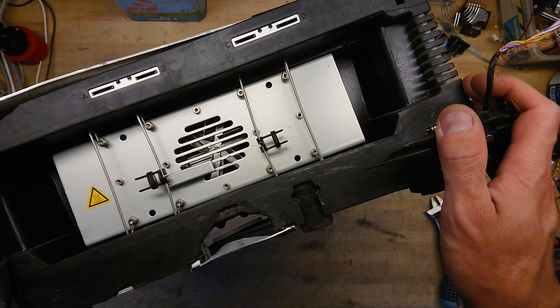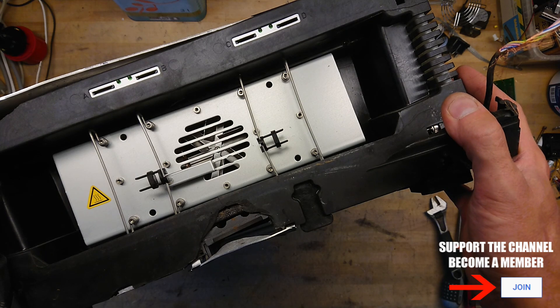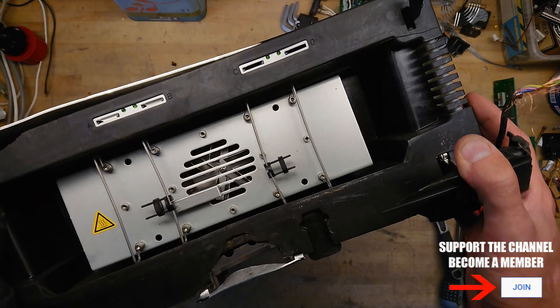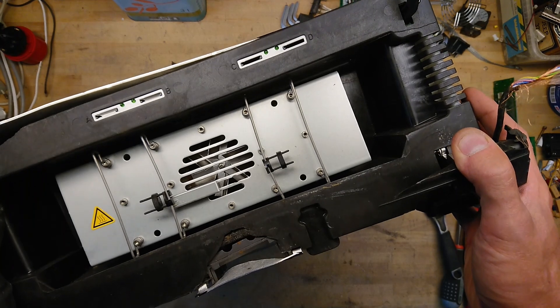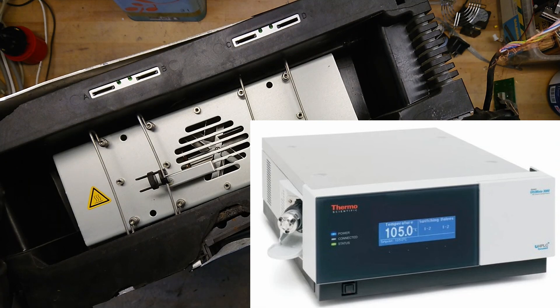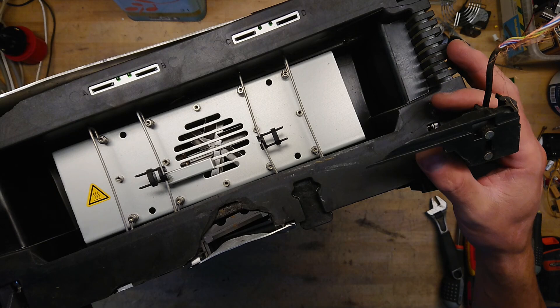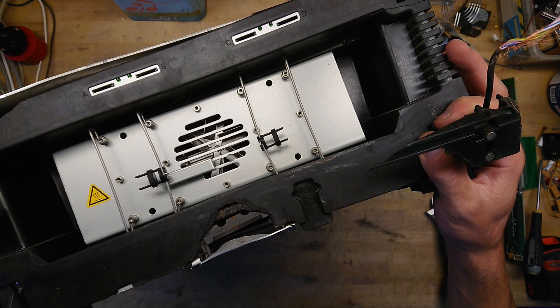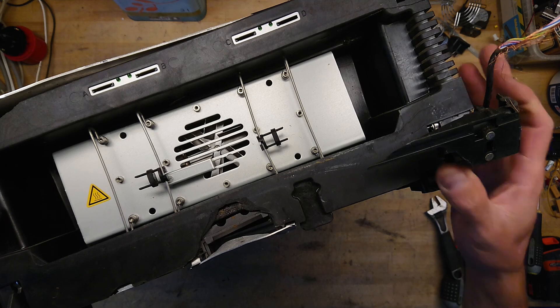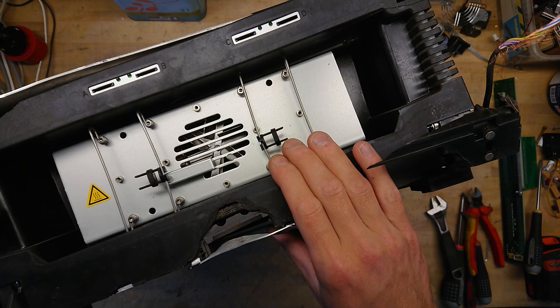Hi all, Maz Barnkopp from Kaiser Power Electronics. Today I'm here with another pretty smashed-up piece of lab equipment. This is a thermostatic controlled column. The idea in this instrument — it is also part of a HPLC setup, which is a high pressure liquid chromatography setup — is that it can keep a liquid at a very precise temperature between 0 to 100 degrees Celsius at 0.1 degree precision.